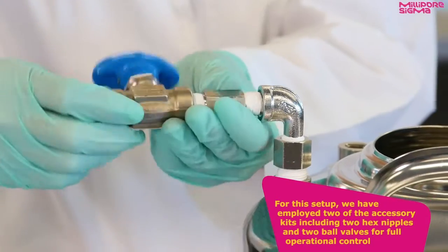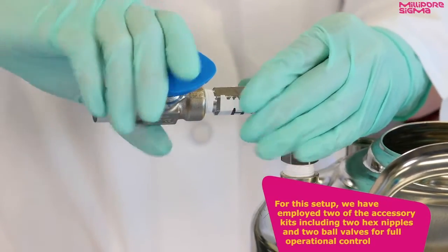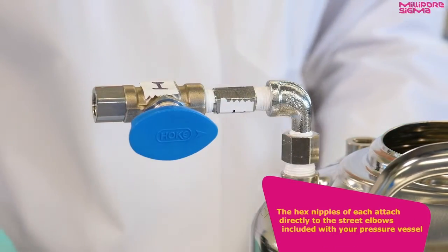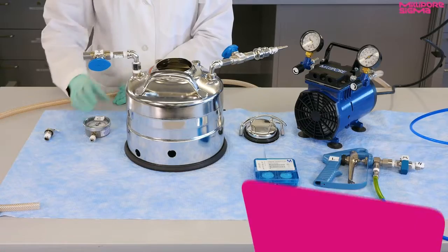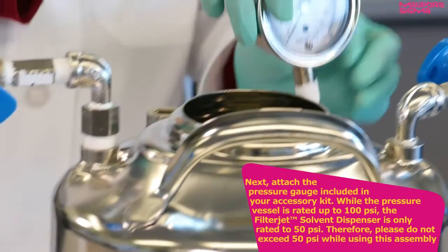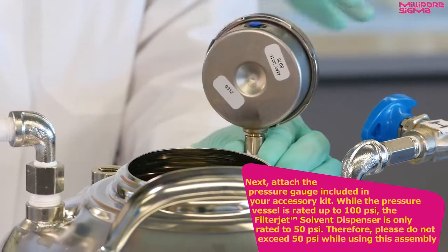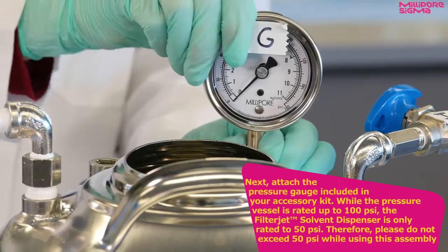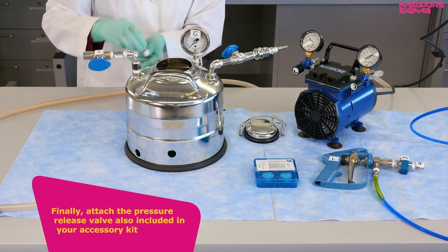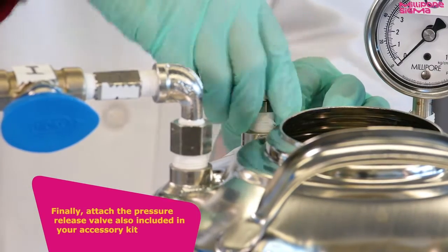For this setup, we have employed two of the accessory kits including two hex nipples and two ball valves for full operational control. The hex nipples of each attach directly to the street elbows, included with your pressure vessel. Next, attach the pressure gauge included in your accessory kit. While the pressure vessel is rated up to 100 psi, the filter jet is only rated to 50 psi. Therefore, please do not exceed 50 psi while using this assembly. Finally, attach the pressure release valve also included in your accessory kit as shown previously.